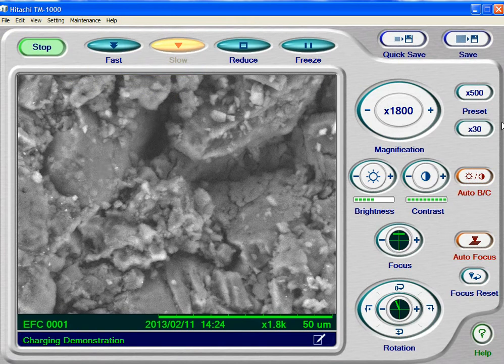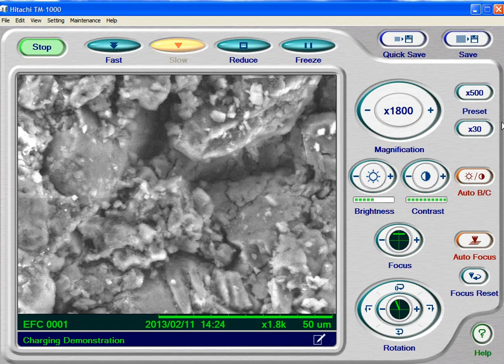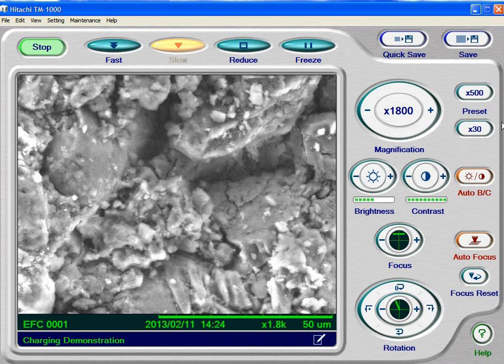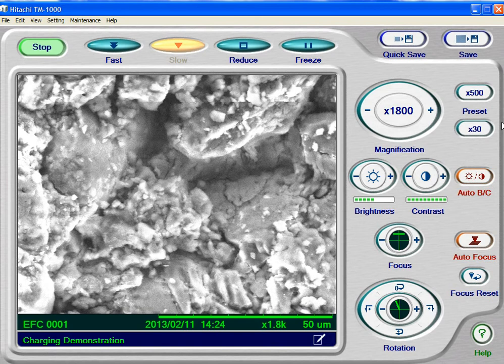Standard mode pulls more air out of the viewing chamber. What's going to happen over a period of time — if you'll watch carefully — is this specimen, the Tylenol here, will start to charge up. By charge up, it means it's going to literally become negatively charged. Since what the detectors detect are electrons, once this thing gets charged up, it gives off tons of electrons, and you just get a brighter and brighter and brighter image, and then it really starts to glow and you don't see any detail at all.